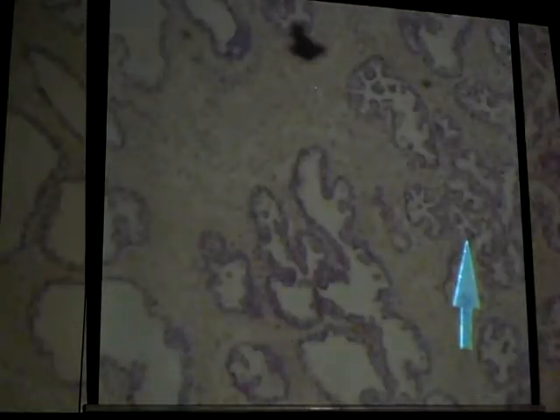All right, the next gland is your prostate. So again, this is a low power ID. Just ID the gland. With your prostate gland, it's not a single gland, but it's made up of all these tiny glands that come together to make up your prostate.